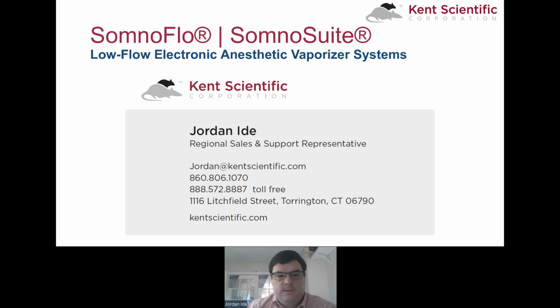Okay, can the system be gas sterilized? If not, how would you clean it? Yeah, the system can be gas sterilized. Besides that, that's the best way to clean the insides. Like I said, outside you can clean everything with your normal lab cleaner, disinfectant. Okay, that's very easy and very helpful. Thank you so much.